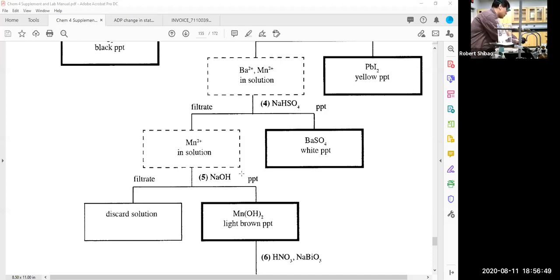And so insoluble means that it depends on how much water and how much heat we have. And so it is possible that not all the lead chloride dissolves, like in the last unknown that we had. We just don't have enough water to dissolve it all. And so this white solid that's left in here could be excess lead-2 chloride that just won't dissolve because I need to add a bunch more water, or it could be silver chloride.